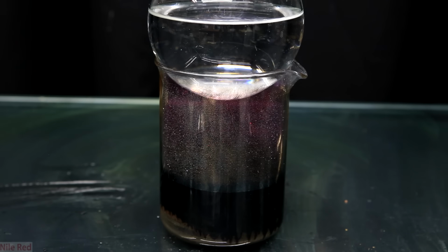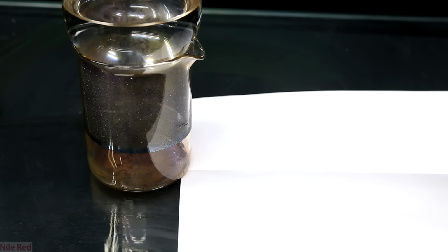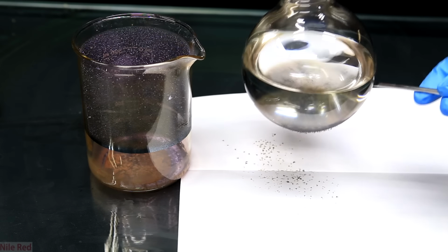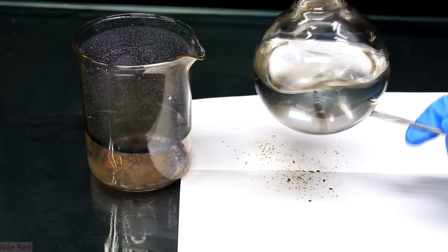When we feel like enough crystals have settled on the side of the beaker, we take it off heat and let it cool down. Once it cools, you notice that all of the purple stuff on the side of the beaker is now gone. So now it's time to harvest the crystals, and the first thing we do is we take off the flask and scrape off the crystals that might have collected on it.